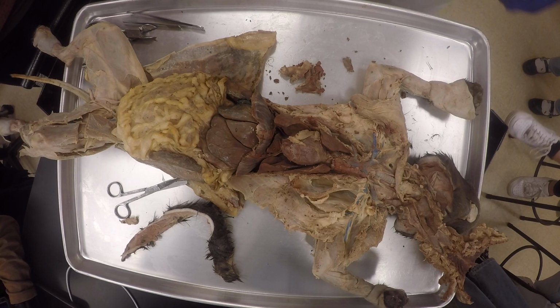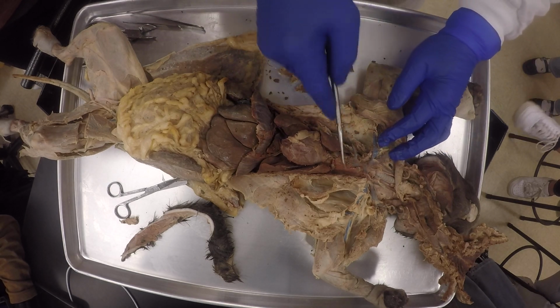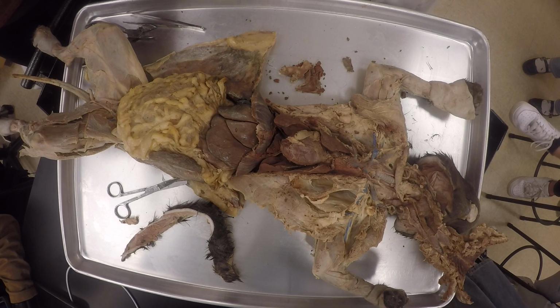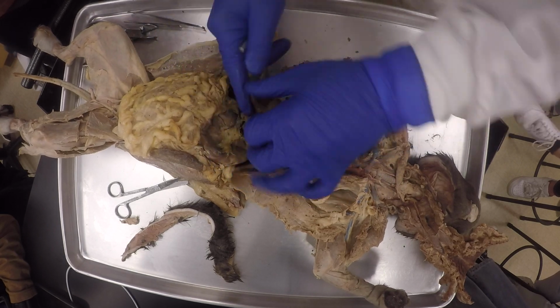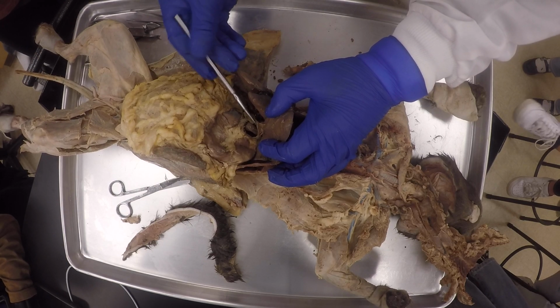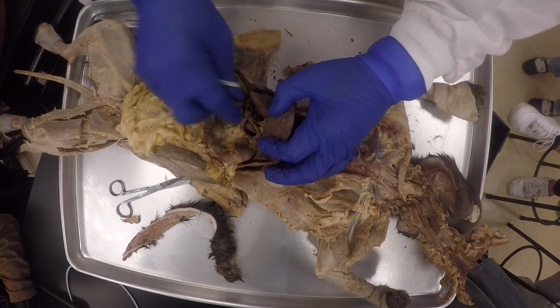Very good. Exactly. Thank you so much. This is the fifth lobe underneath there, right? That's the caudate lobe right there. Do you see the caudate lobe? I'll show it to you right now. Boom, boom, boom, caudate lobe. That's what you thought correctly, my good friend Nikki Gruders.